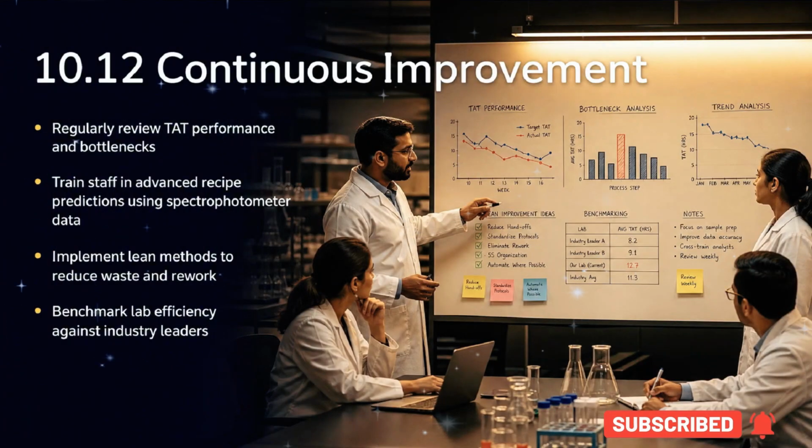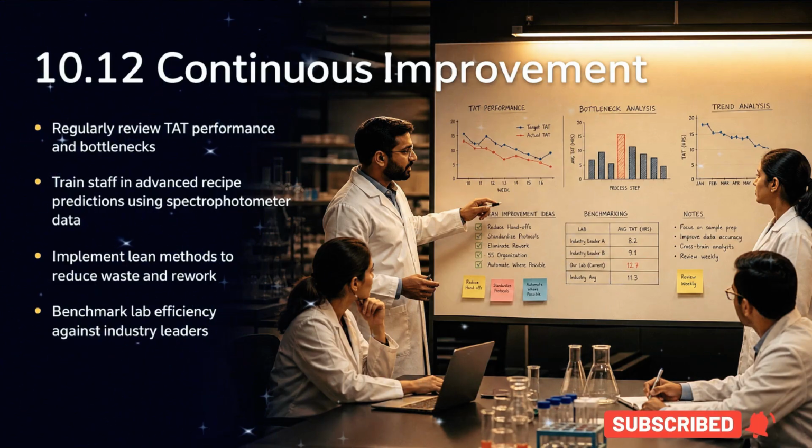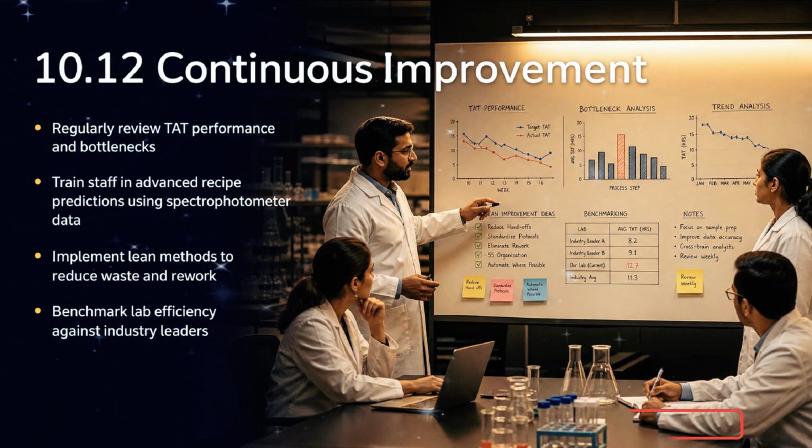Finally, commit to continuous improvement. Regularly review performance data. Train staff in advanced techniques. Implement lean methods to reduce waste, and benchmark your lab's efficiency against industry standards.